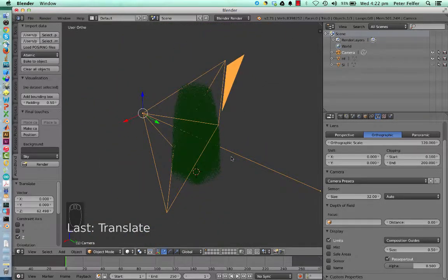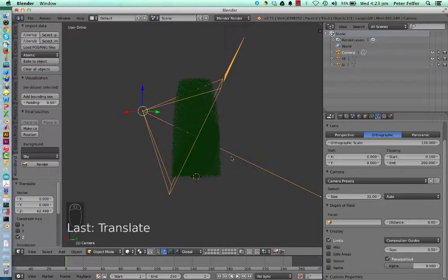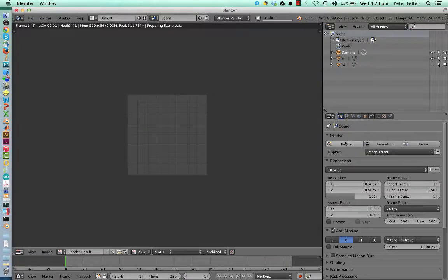You can actually use that to make things like fly-through movies through your data. I've just created one today. Makes it very simple because you can animate how long this clipping distance should be. Anyway, so all this is well and good. And if we go back into camera view, maybe grab it upwards a little bit so that it's nice and in the middle, we're already good to render.